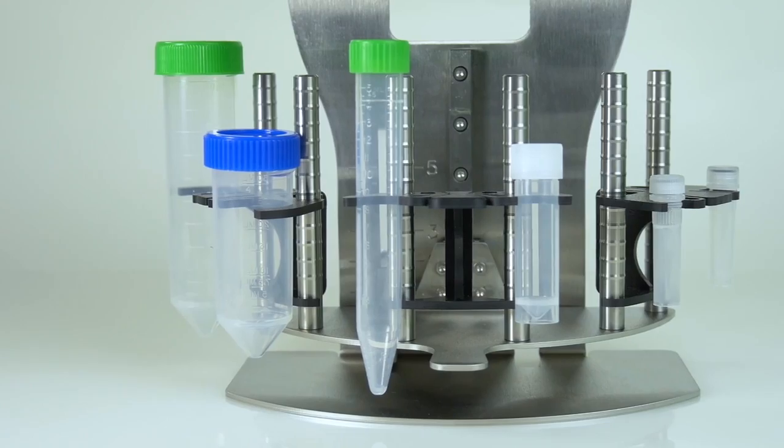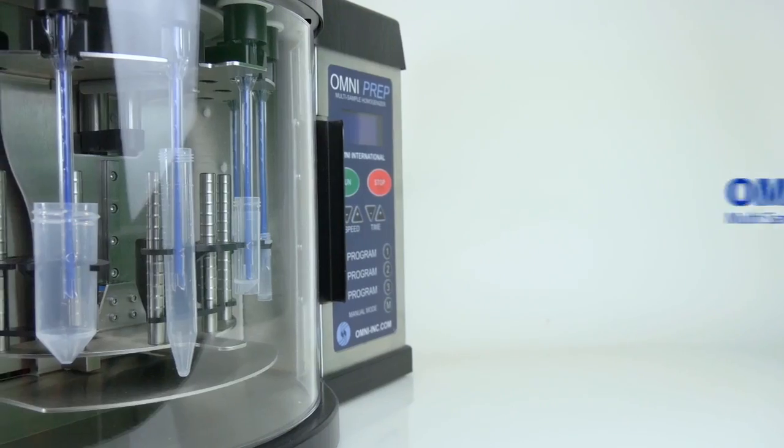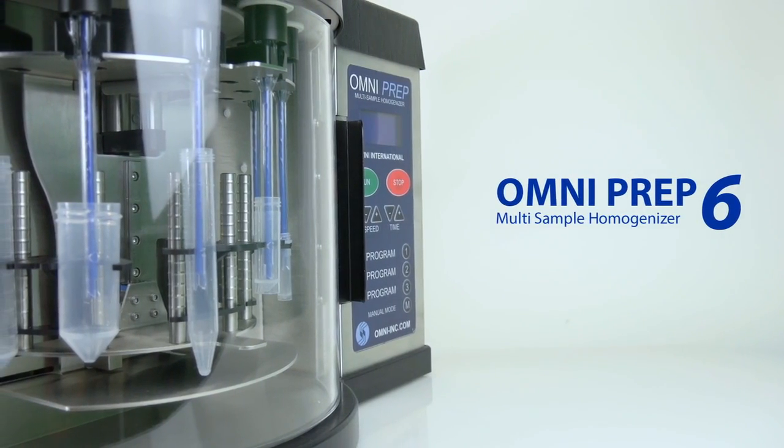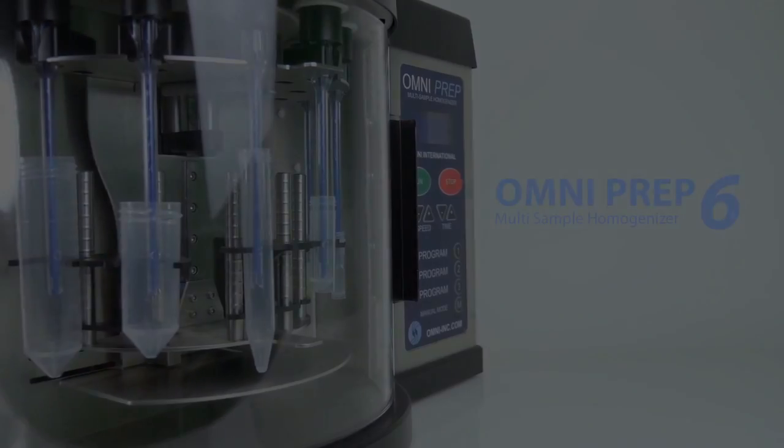With its interchangeable tube carriages, maintenance-free brushless motor, and variable speed processing, the OmniPrep 6 is a versatile and ideal front-end sample preparation platform.